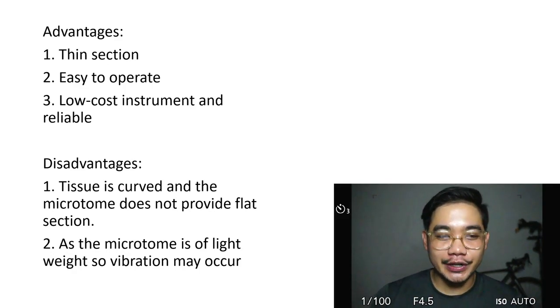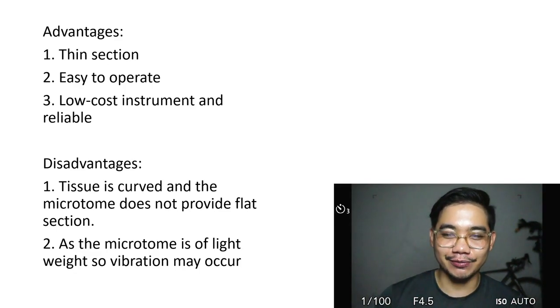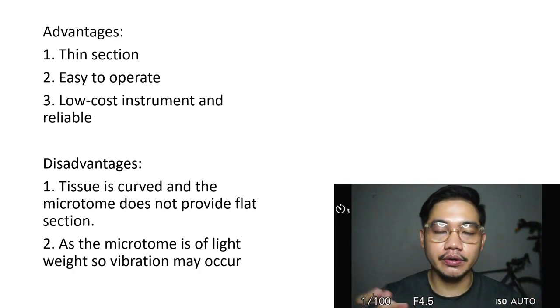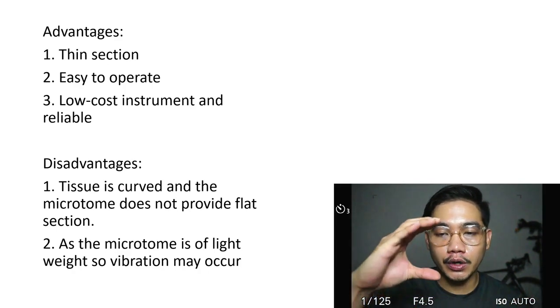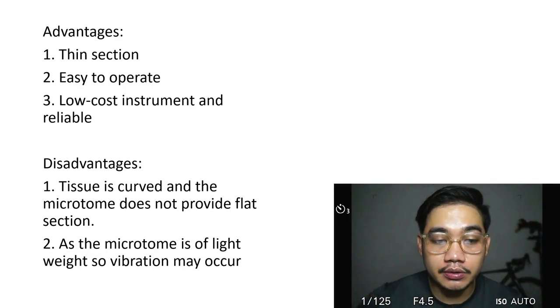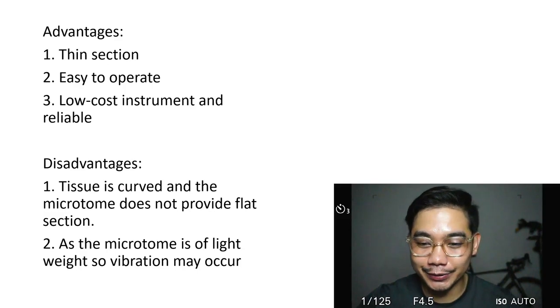Now the disadvantages. The tissue is curved and the microtome does not provide a flat section. Well, that's to be expected because it moves in an arc, versus our rotary microtome, in which the block moves in a linear fashion. As the microtome is lightweight, some vibration may occur.